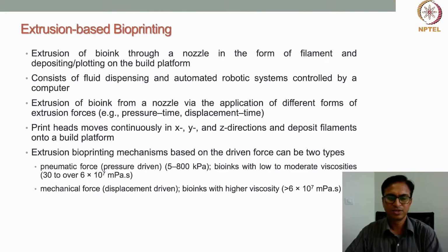Hello students, welcome to the organ printing course. In the earlier lectures we have discussed 3D bioprinting. What is 3D bioprinting? What are the different types of techniques available within bioprinting? And then we also discussed the first technology, that is inkjet printing technology. In this lecture we'll discuss the second type of bioprinting technology, that is extrusion based bioprinting.